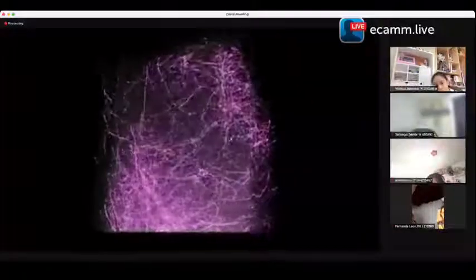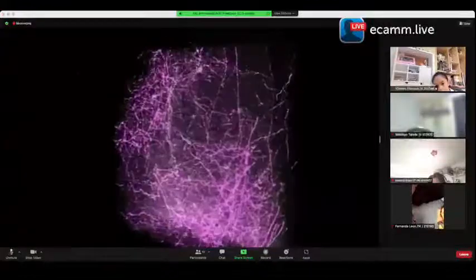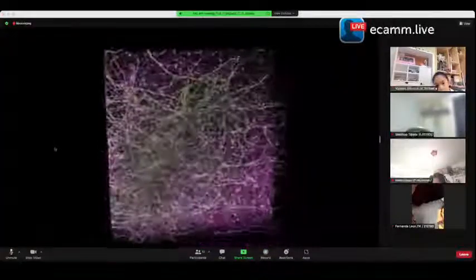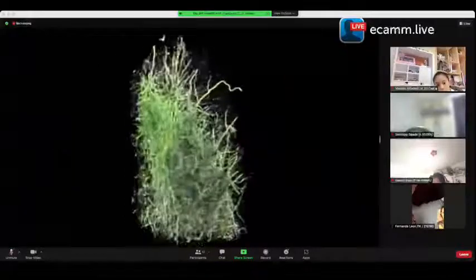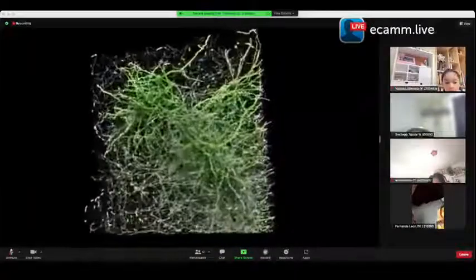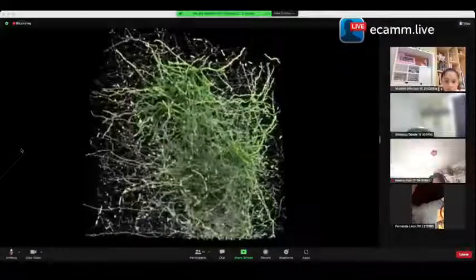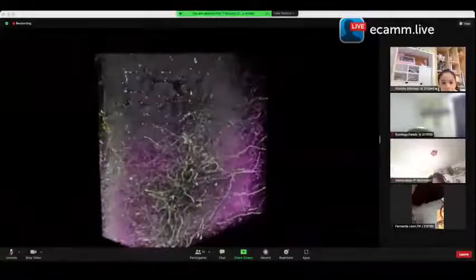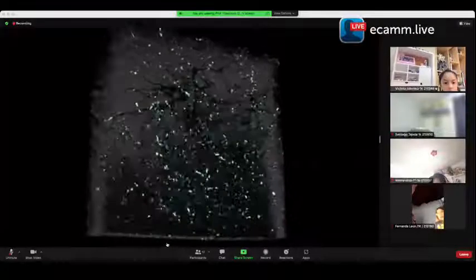We've also used some recent advancements in genetic engineering to select only the neurons inside this region that connect to the amygdala and dye them green. By combining both the green and purple dyes, we're able to see the full circuit of connections, viewing both the neurons that connect to the amygdala and connections coming back in from the amygdala. The locations and patterns of the neural connections, called synapses, show us how heavily these two groups of neurons are connected.